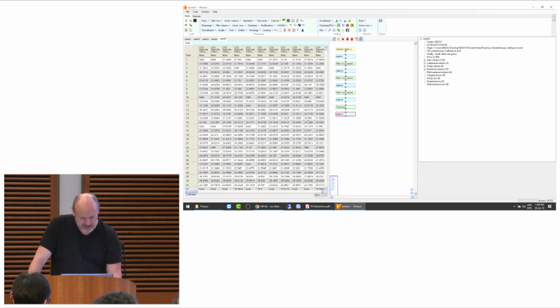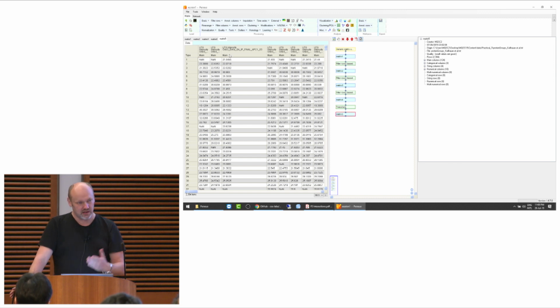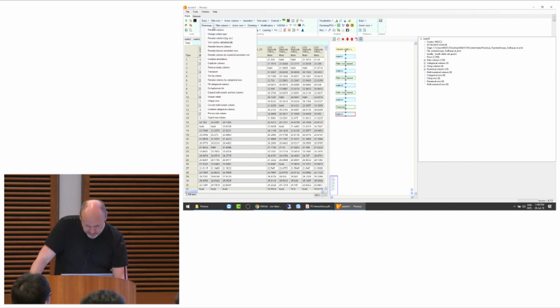So we are back to just after the log transformation, and now the first thing we do is we realize that these column names are really very chunky and repetitive. We want to cut them down to be a bit more useful. So basically this LFQ intensity, and then OB3, and that's probably Eva Keilhauer here, and so on. All of this is repeated in all of the names, so it has no information at all. So let's remove that.